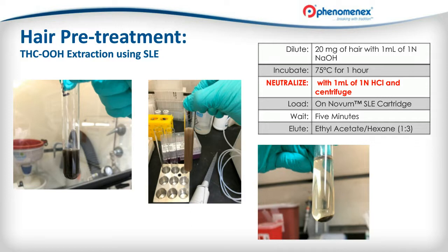Getting everything ready is what takes a lot longer than the 30 to 45 minutes that you actually spend doing the actual chemical extraction. So this pretreatment, for example, we're looking at, I'm working on this right now.